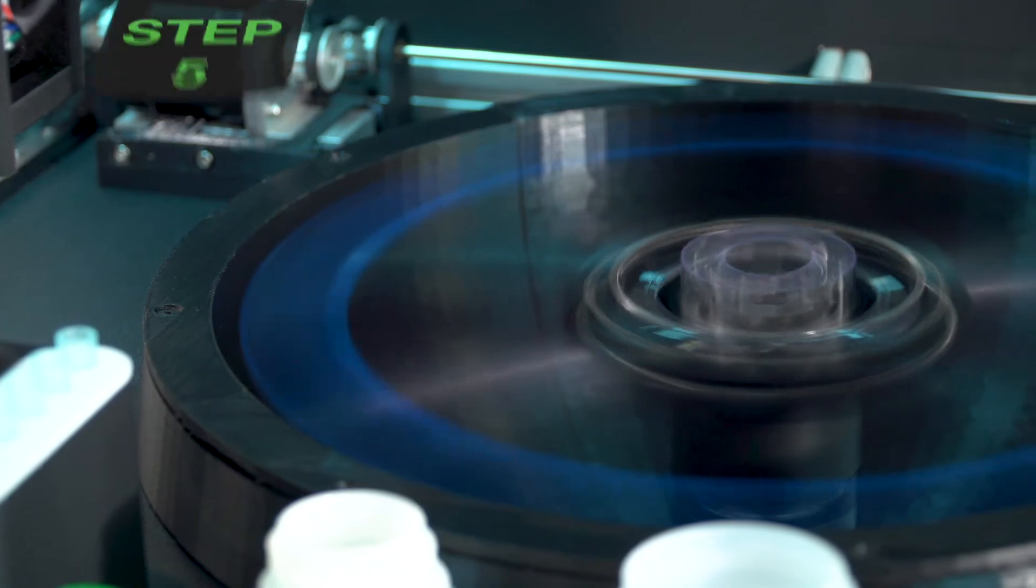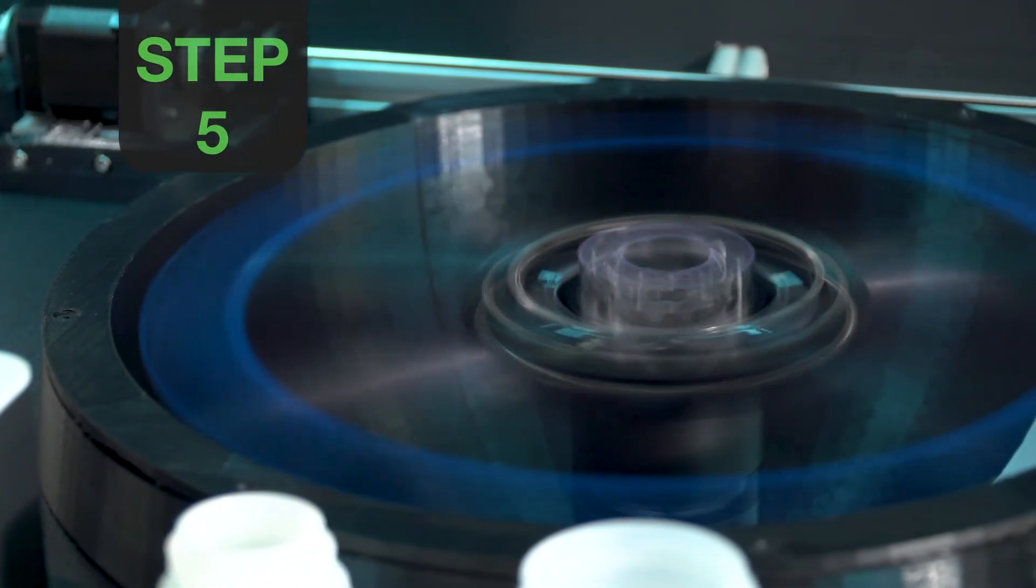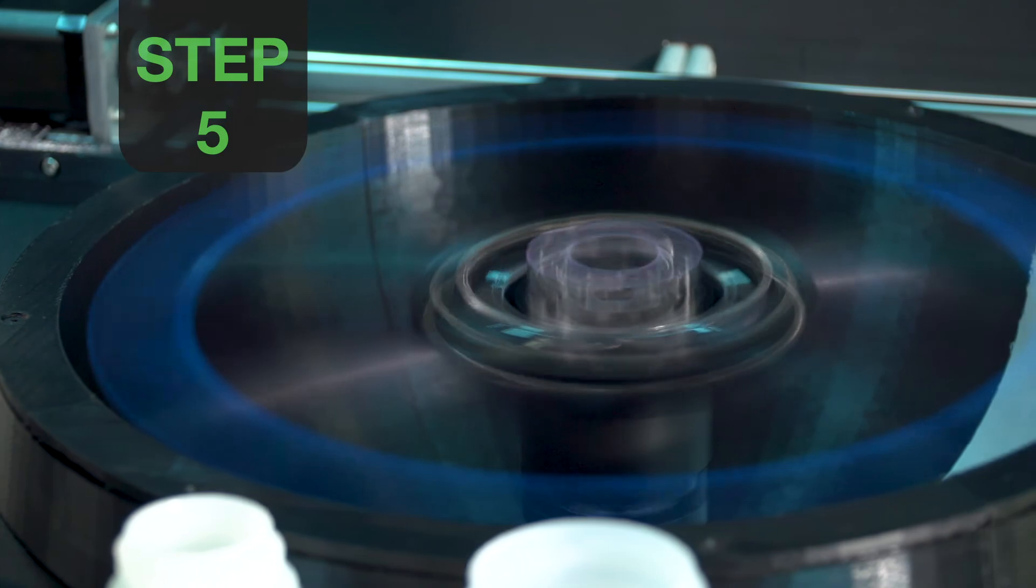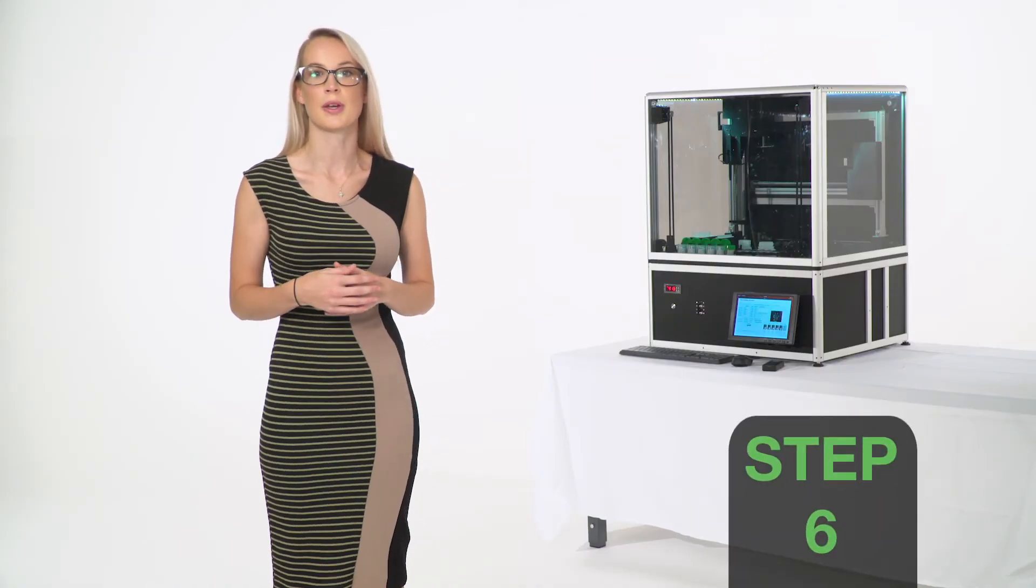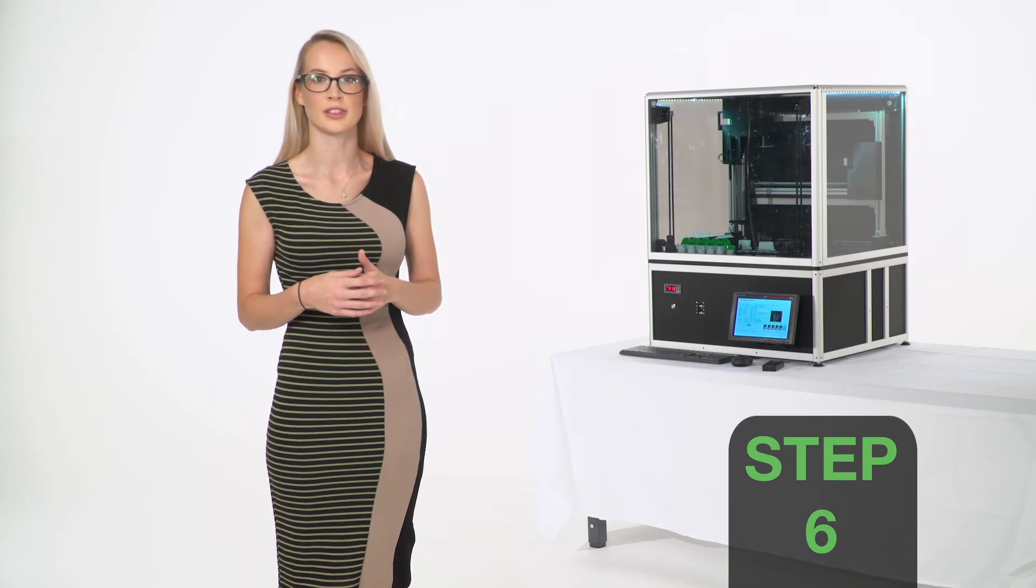The specimens are then centrifuged a second time at high speed to produce a well-formed cell pellet. The AutoLP Pro analyzes each specimen pellet and stores the information to be used during the processing.